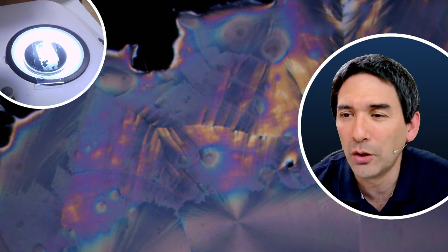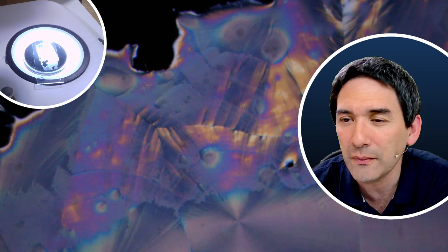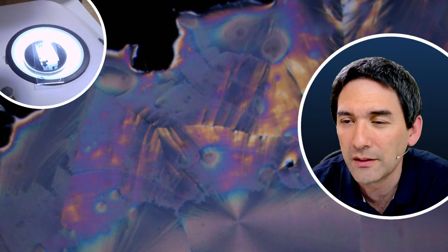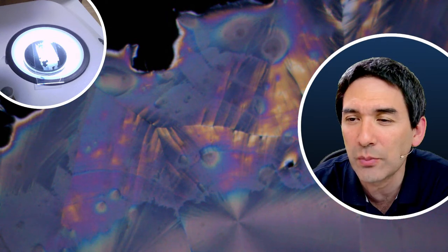So I will always interrupt myself again to read a couple of comments here. Okay, some people are talking about tardigrades here. Someone asks whether the light coming from objects is in a different plane, and that's why the background is black.